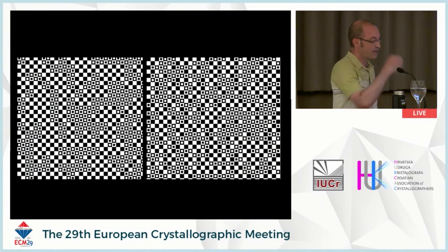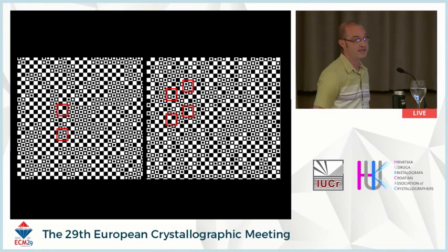If we were to take an image that is related to that one and introduce some variation, but two different types of variation. On the left, I have one type that's based on two different types of unit cell. And on the right, I have an image that is based on four different types of unit cell. Now, the thing about these two is they have the same mean pattern, so the mean unit cell looks the same.